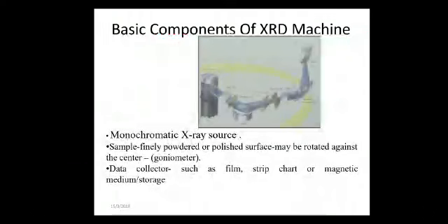The production of X-rays is obtained in three ways: by bombardment of metal targets with a beam of high energy electrons, or by exposure of a substance to a primary beam of X-rays in order to generate a secondary beam of X-ray fluorescence, or by using a radioactive source whose decay results in X-ray emission. X-rays are produced whenever high-speed electrons collide with the metal targets.